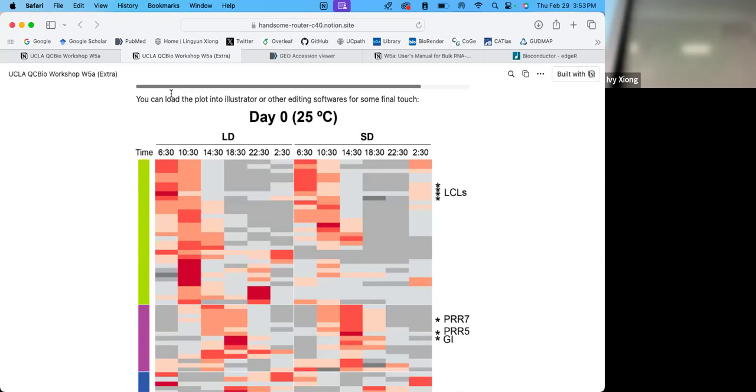I think she says here, for this, give it a name. And this is when you submit the job. So you queue stuff, right, that is extra. I don't specify anything. You say you want counts, then it would, so that's what she translated. I think it's like that.